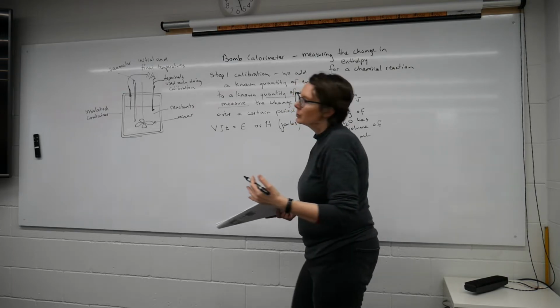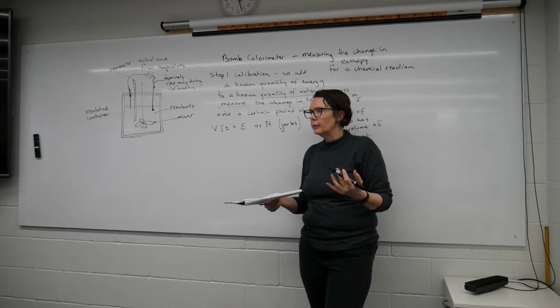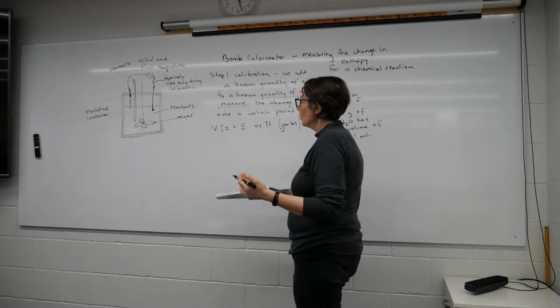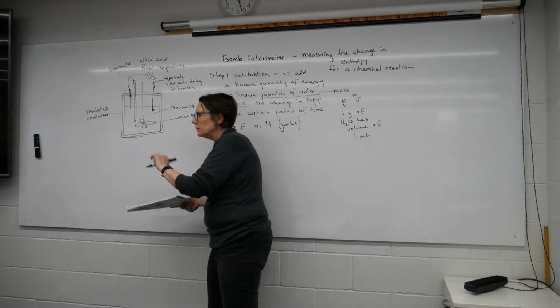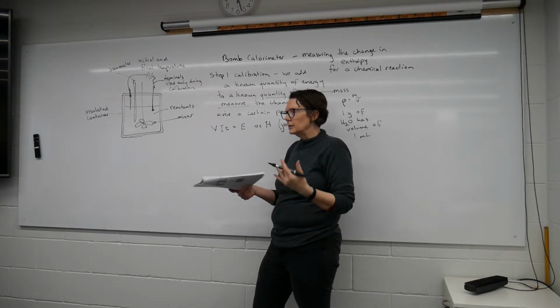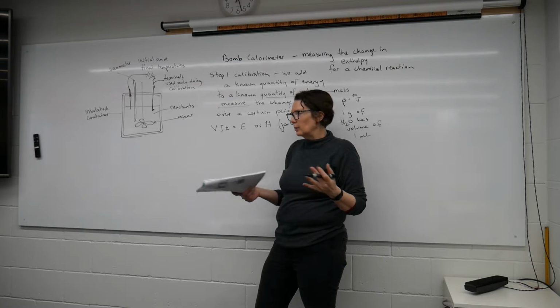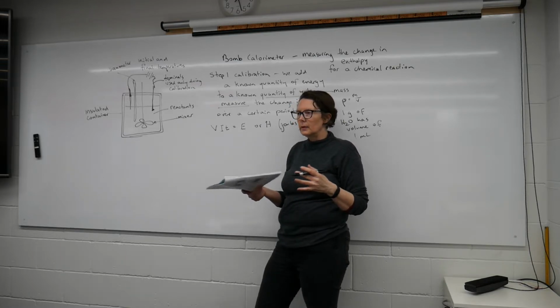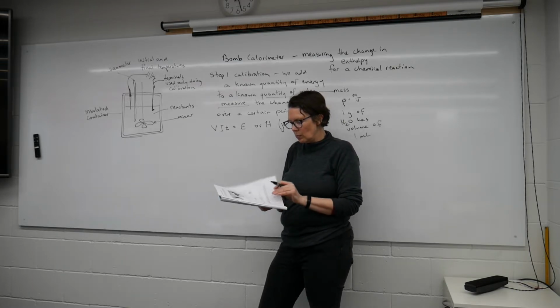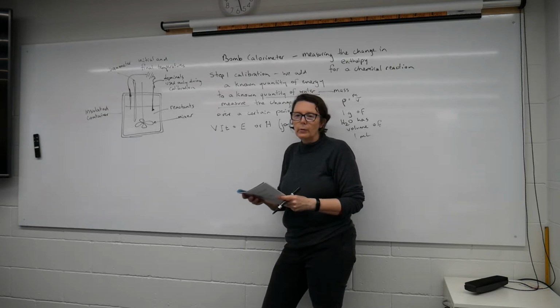Now, yes, it won't be perfect, you won't get perfect results, because what we're assuming is that all of the energy from the reaction is going into increasing or decreasing the temperature of the water. But there will be losses. In what way do you think we might have losses? Where can we have losses?